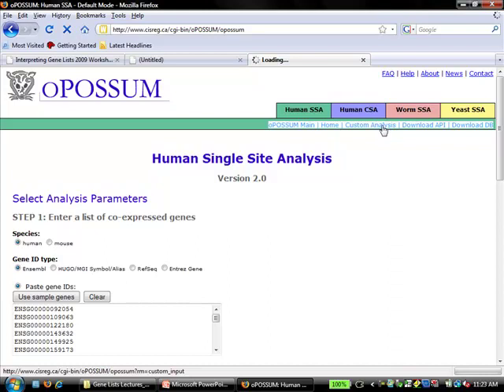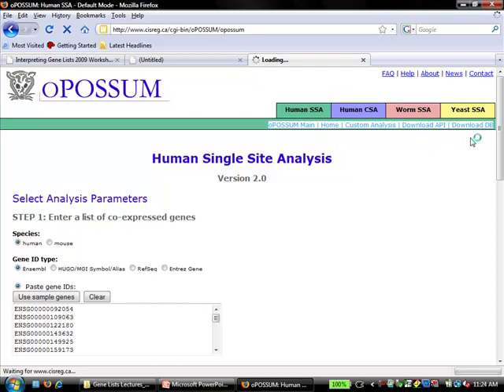The system is based on Ensembl underneath. If you have an Ensembl ID, that's your best bet because you know it won't have mapping problems. It works with what Ensembl has mapped for gene symbols. In the custom analysis tab, you can set up your own background set and adjust more parameters. For those of you who are computer programmers, you can also call into the database through an API and do this programmatically.